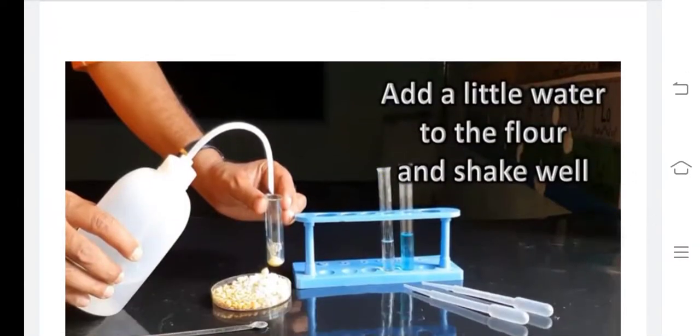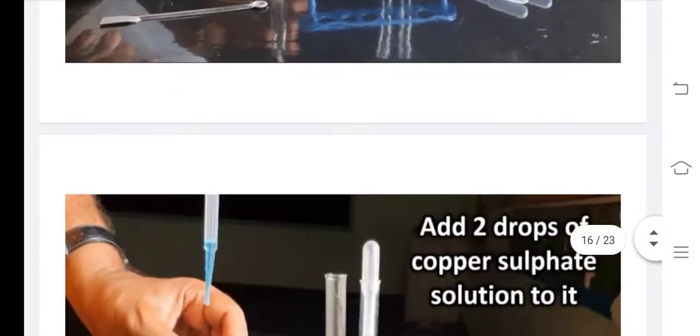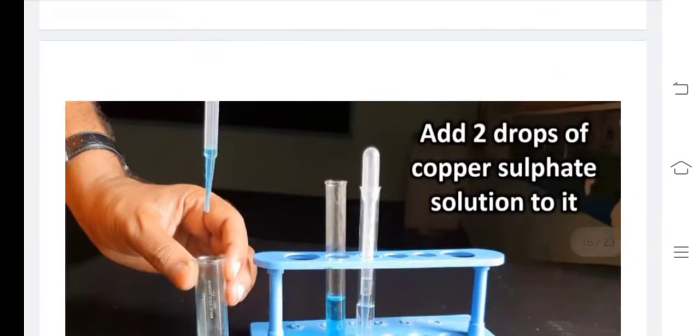Next one here: add a little water to the flour and shake well. What are they adding, children? Now they are adding water. Ma'am, why are they adding water? To make the food item soft and paste. So they are adding water to the flour. Right children? Next one is very important, two chemicals. I told you what are the materials required in that.